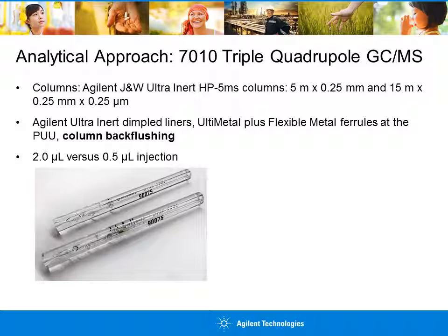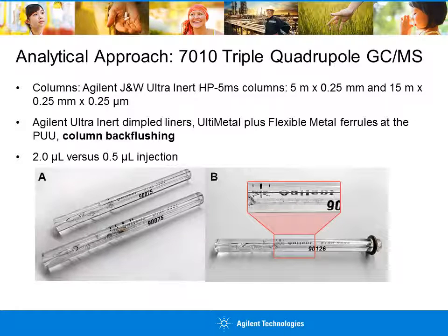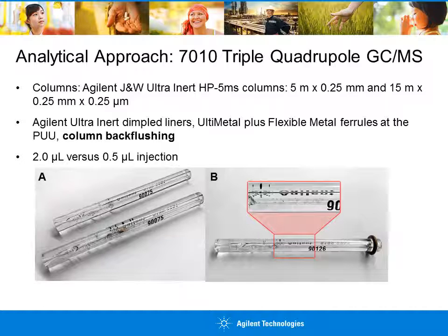The slide shows two GC inlet liners with different sample volumes injected over the course of a sequence. Liner A (lower left) had a greater amount of sample injected — 2.0 microliters over 65 injections — and clearly contains increased deposits, which shortens the usable lifetime of the liner and adds additional maintenance costs. Liner B (right) had reduced sample volume injected — 0.5 microliters — but over 200+ injections. As you can see, it is almost free of visible deposits, shown clearly in the magnified view, which prolongs performance and decreases maintenance costs.